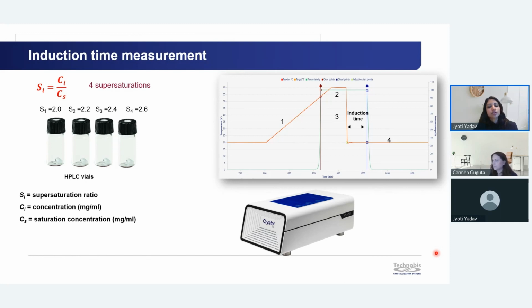And this is mostly useful for compounds that degrade after some cycles, especially if you see some changes in the compound after a few cycles, 10 or 20 cycles. So for those compounds, you can perform the experiments in multiple sets, 10 experiments or 20 or 30, and then take those experiments and combine them in multi-analysis.